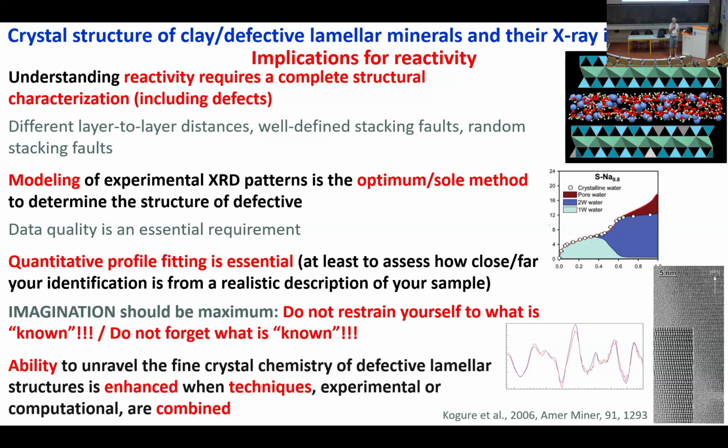How would you approach that from an X-ray perspective, or would you basically just use the X-ray diffraction to start with? We're still going to make everything homoionic, and then go back and maybe look at that initial pattern and try and guess what was there after making everything homoionic. Like, would you run your sample kind of as received first, and then go through the processes that you've talked about?